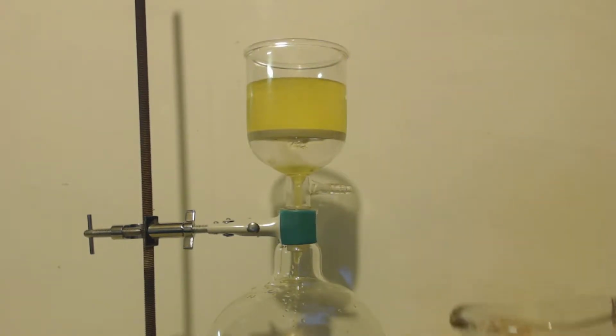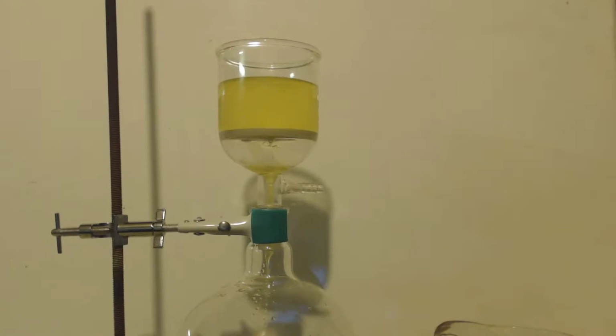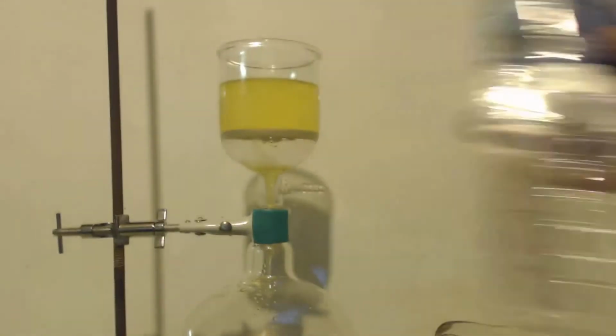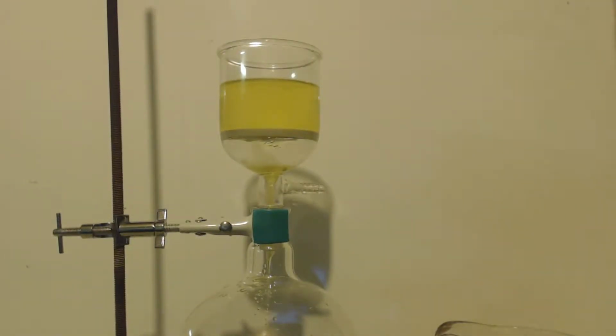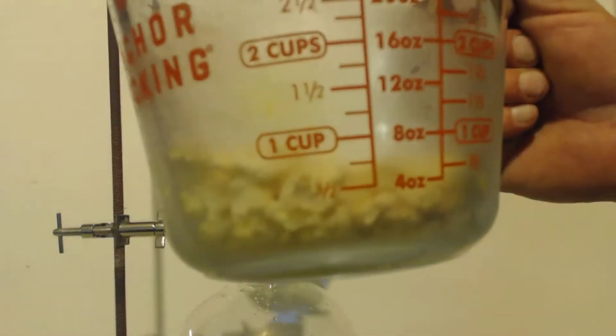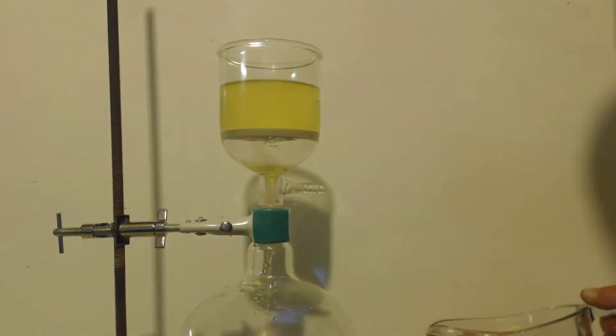So I'm going to filter this. Then I have some water that I put into the freezer, so it's freezing up right now. It's getting nice and cool. Once I get all the liquid water out of there, I still have all this. I'm going to throw it in there and wash it with that cold water.